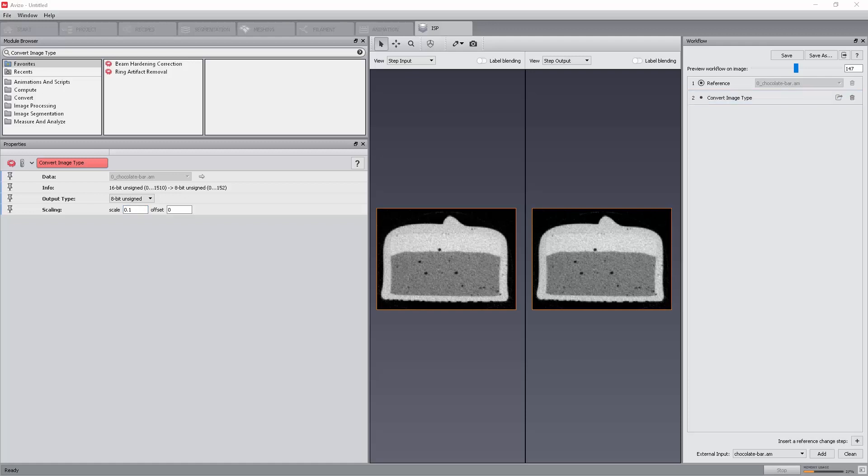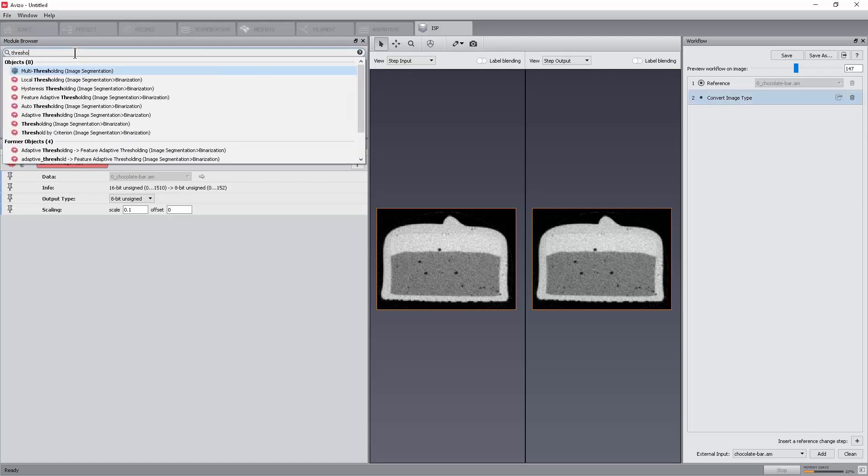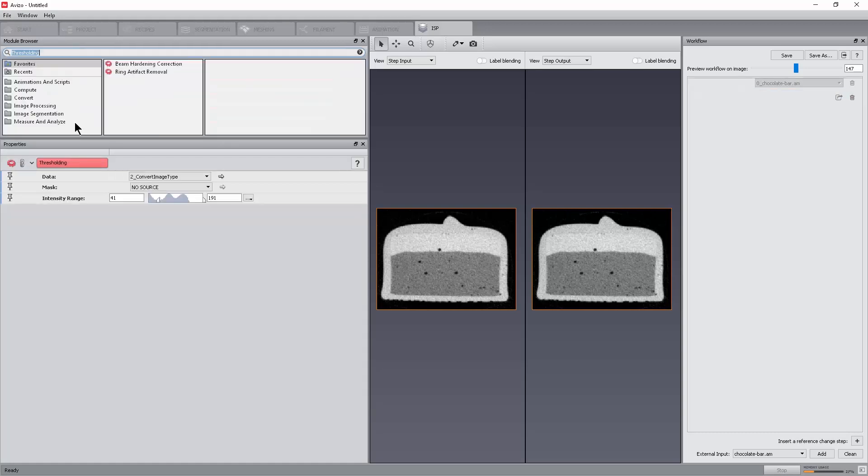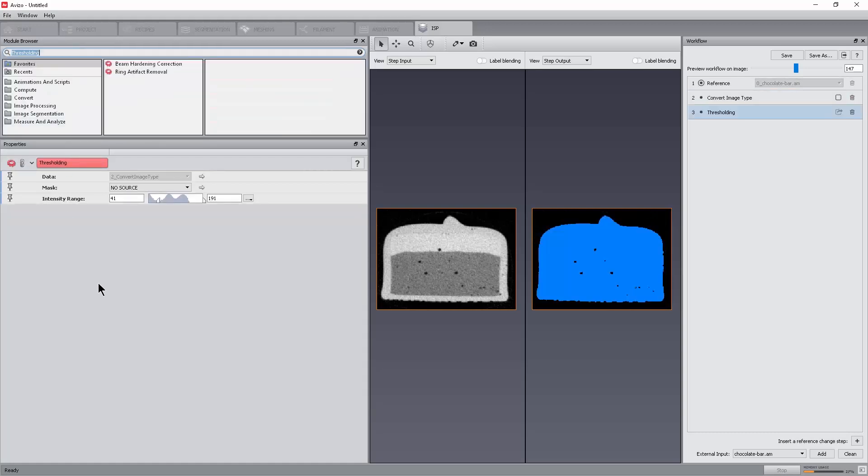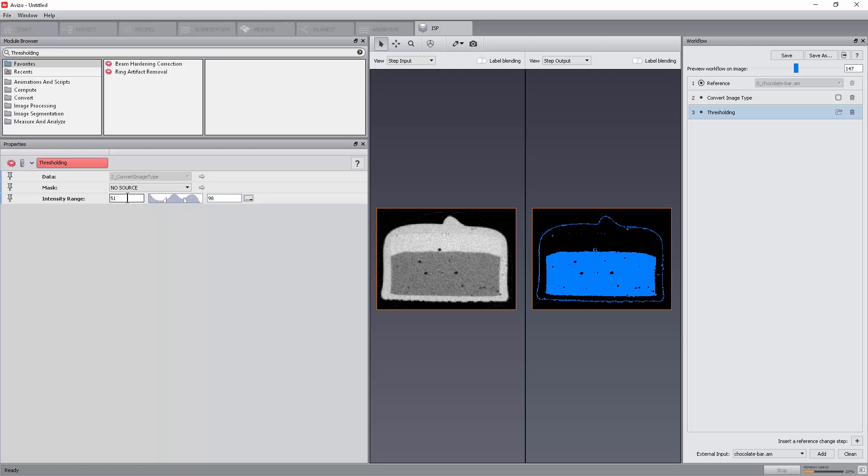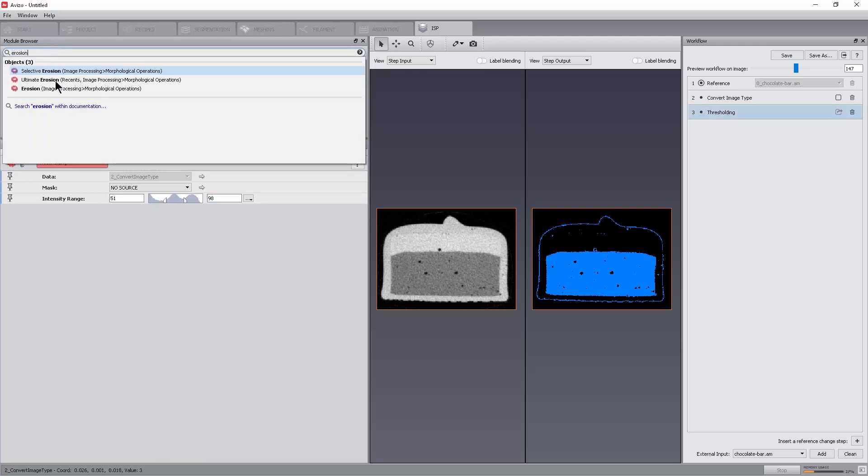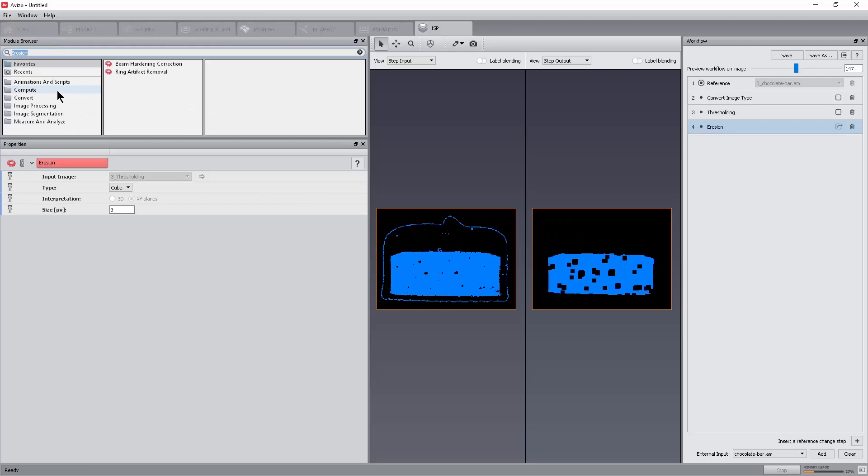We will now add several tools to the workflow in order to build a mask for the Nougat phase. A thresholding to roughly select Nougat. Set the intensity range to 51 to 98.